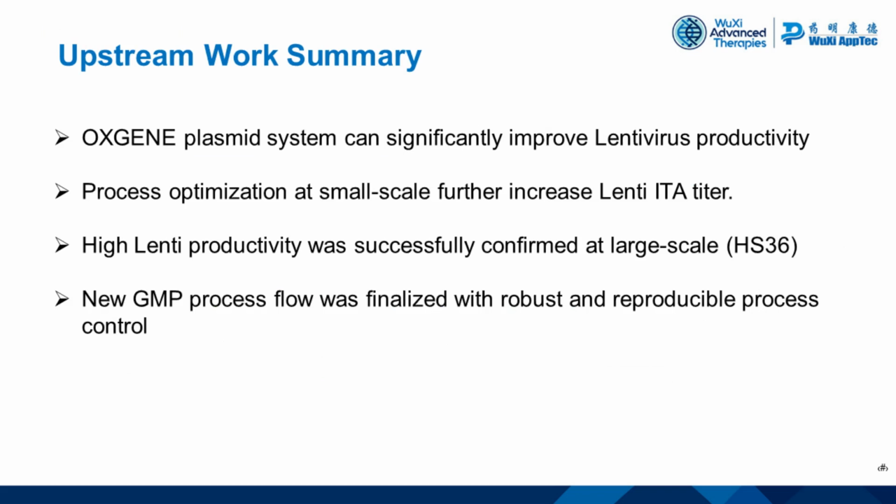In summary, we achieve a significant improvement of lenti productivity in our new platform by optimizing the plasmid and cell culture process. The new GMP process flow was also finalized with a robust and reproducible process control. So next, I'm going to pass over to my downstream colleague, Senthil. Thanks so much.